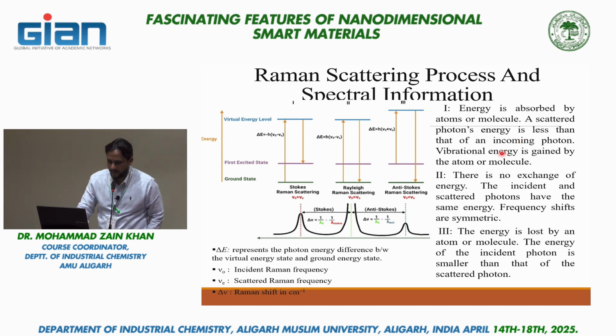The same has been explained over here. I think if you remember Professor Hatau's lecture on day 1, while he was talking of graphenes, he showed you various Raman spectra, and there he showed that Raman spectroscopy is one of the best techniques to characterize graphenes. It helps you to study the disorderness or the defect density of graphenes.